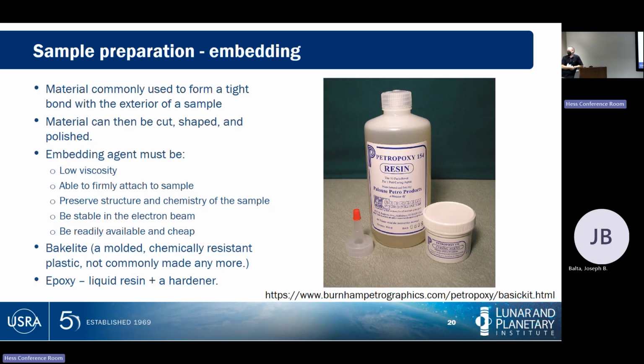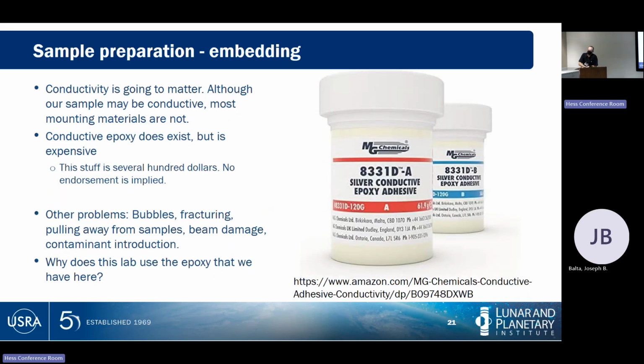Meaning that whatever decision tree went into it, long since passed. Could be what the supplier recommended, could be what was cheapest, could be what was available at the time. That's literally in every lab I've been in. The main answer to that question is, we just use what we've always used.